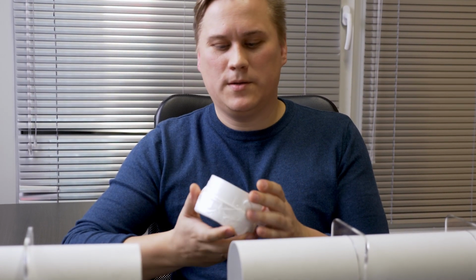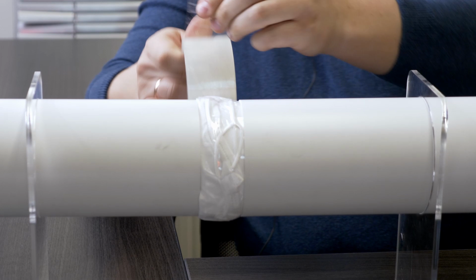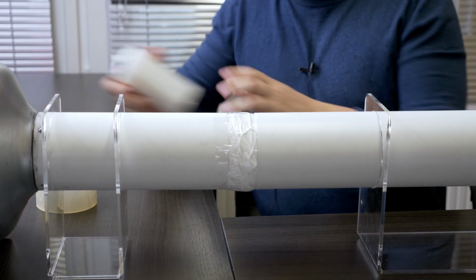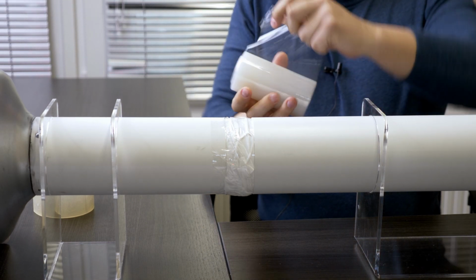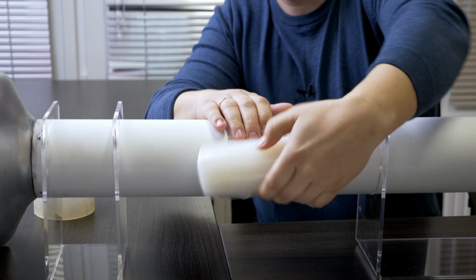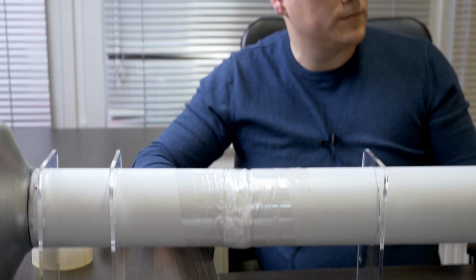Now I will show you how to put the mask on the machine. For impermeability, we will use tape so that there is no air leakage into the pipe. And for ensuring the reliability of the experiment, we will wrap the pipe with cling film. And we will do so with every sample. Now let's turn on the motor and see what the analyzer will show us.